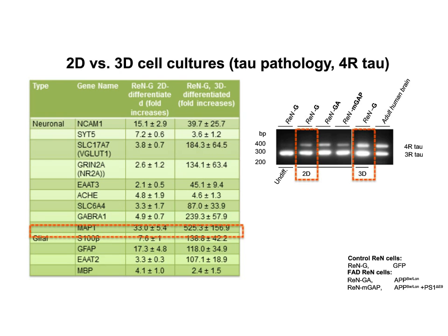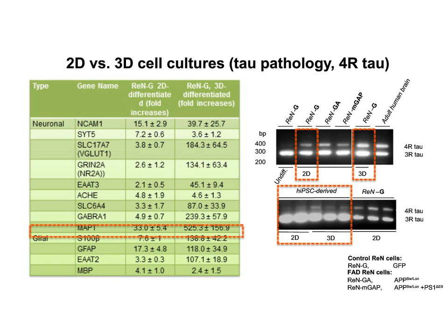And this data is not published, but I want to show you as a reference. We actually grew some human iPSC-derived neural precursor cells, and we differentiated them for 12 weeks. Then we also did the exact same analysis. And you can see in 2D, we could not even detect 4-repeat tau species. 3D makes it a little bit better, but it is still at very low levels, and not even higher than 2D differentiated cells.